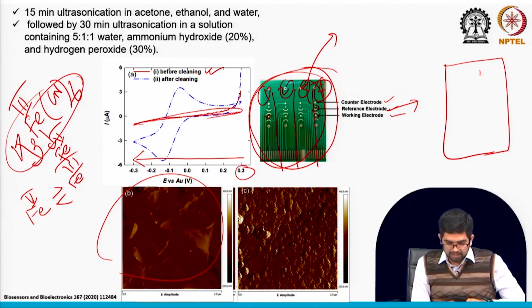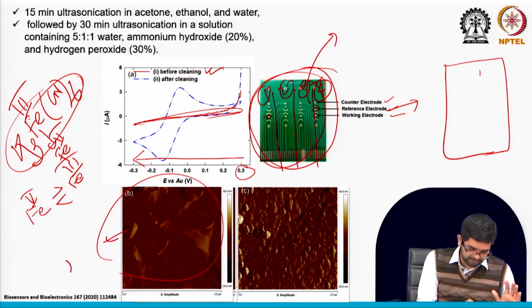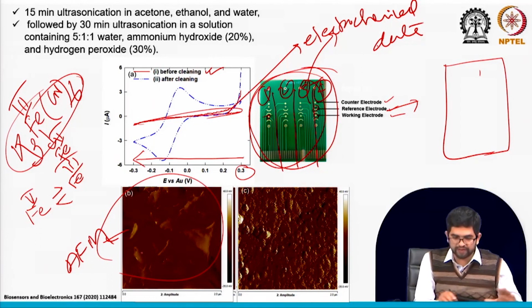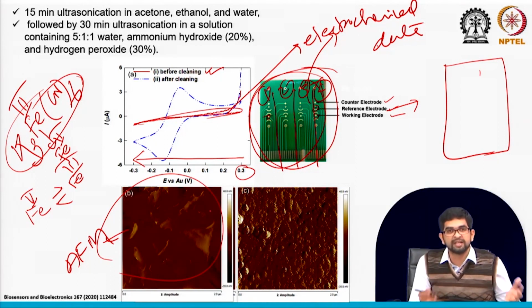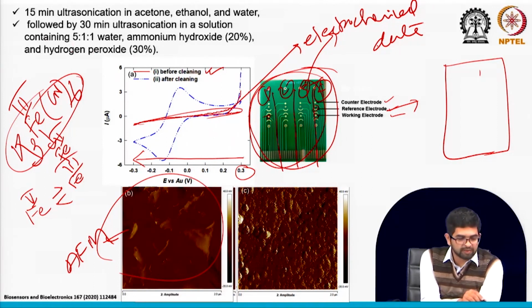Here you can see, from the shape and from the electrochemical data, two ways, one is the AFM data and another is the electrochemical data. These two data can help you to predict the surface impurities you have. Now you can go for some surface cleaning or surface pretreatment method. What pretreatment are we following in this case? I already taught you some different pretreatment methods.